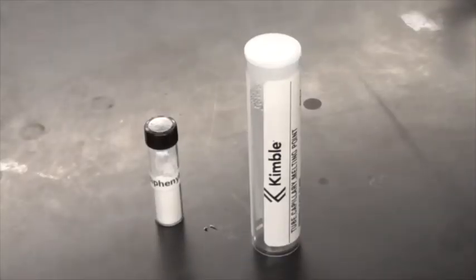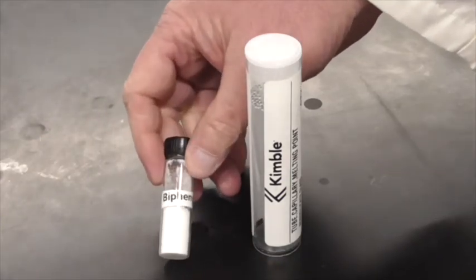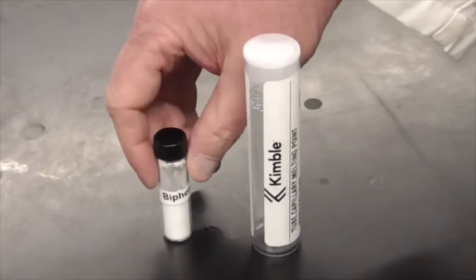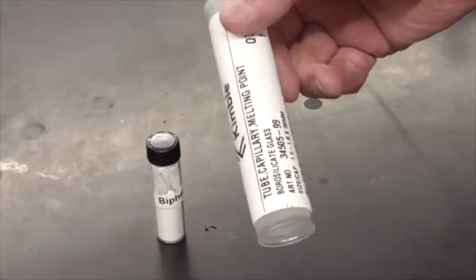Okay, so now that we're done with the paradichlorobenzene and getting the data for its freezing point, we now have to go to our biphenyl and determining its melting point. And to do that, we're going to put the biphenyl in what's called a capillary tube. And a capillary tube is simply a pretty small glass tube.